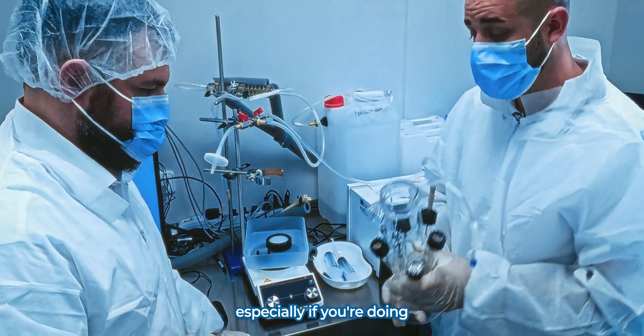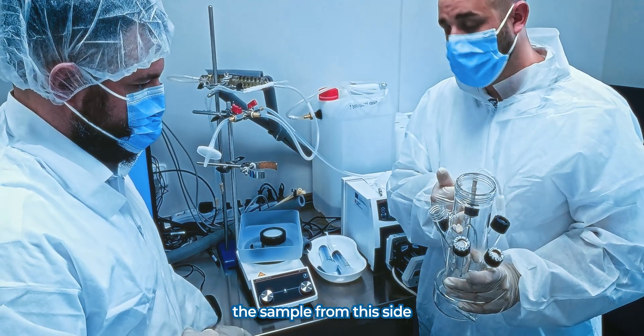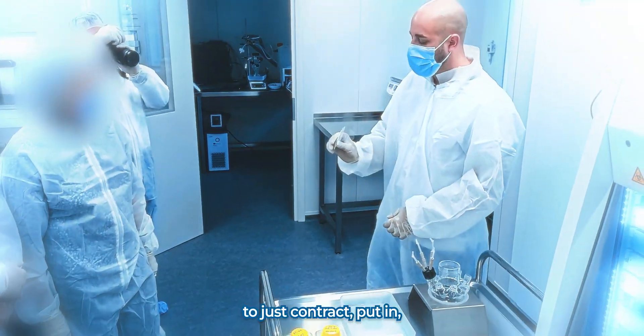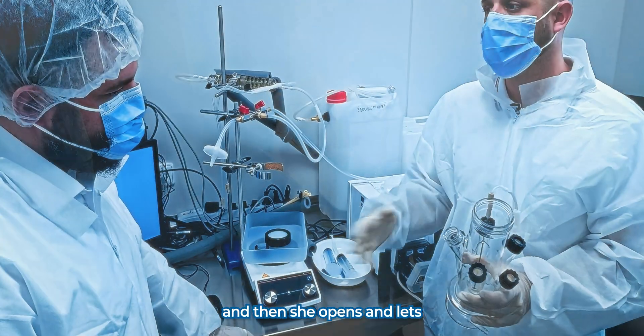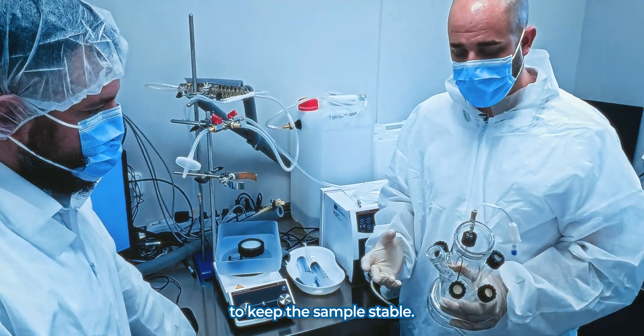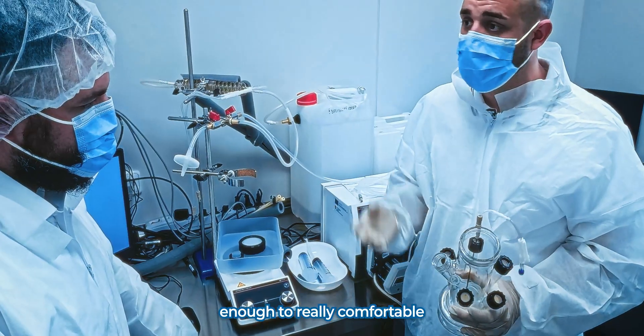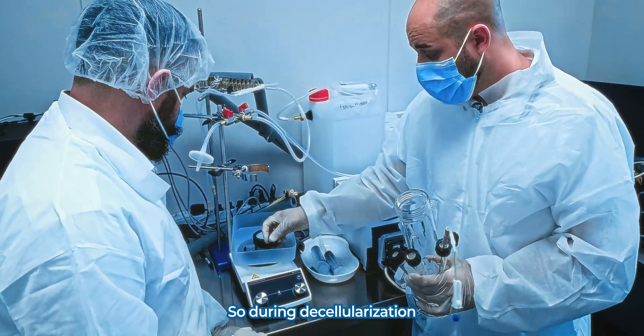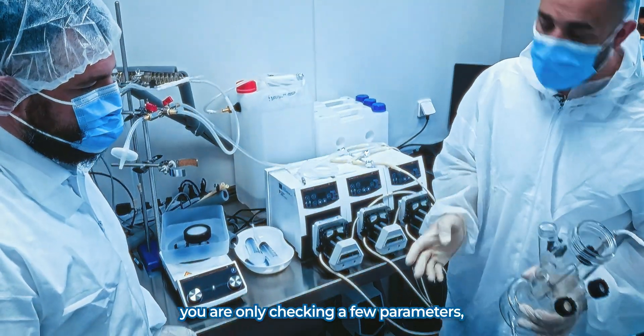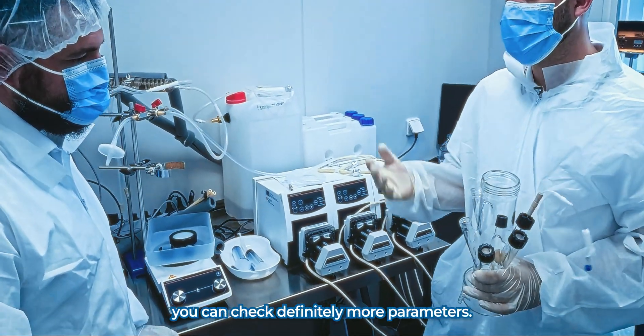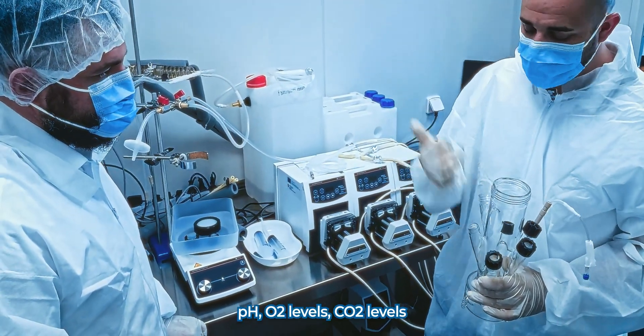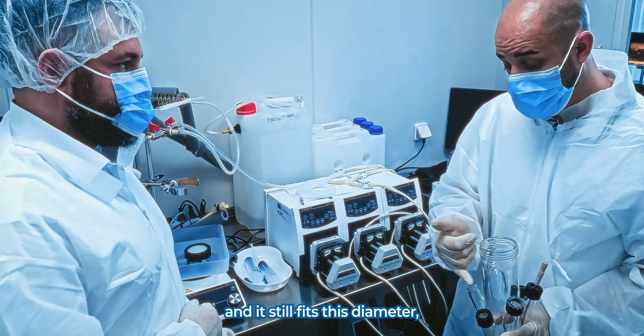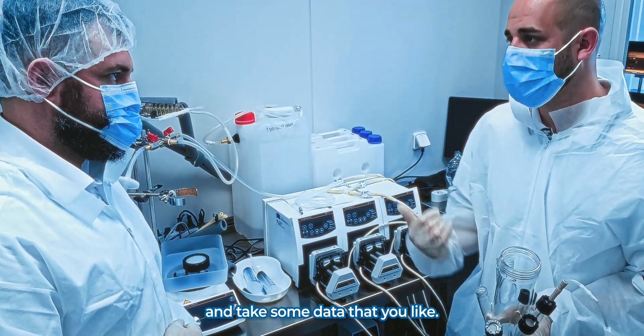Also you can enter the bioreactor from this side. So for sample, especially if you are doing decellularization, you can just enter the sample from this side. Because you're using the flexible mesh. O2 levels, CO2 levels or different gas levels if you like. If you have some super specific device and still fits the diameter, you can still put it in and take some data that you like.